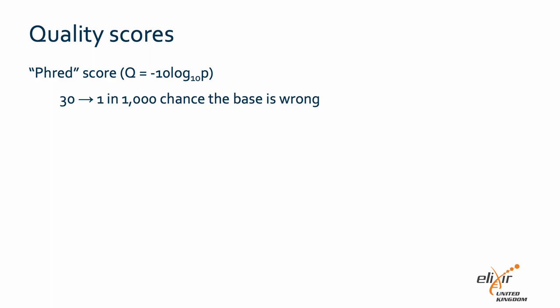Quality is assessed by a Phred score, a play on the name of Professor Frederick Sanger, who won a Nobel Prize for his pioneering work on sequencing, and his eponymous Cambridge Institute was where the FASTQ format was invented. Phred scores typically range from 0 to 40 in short read data. Double digits cause problems when you don't know which integer matches with which base.